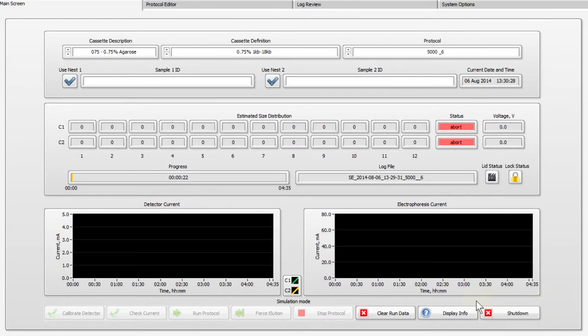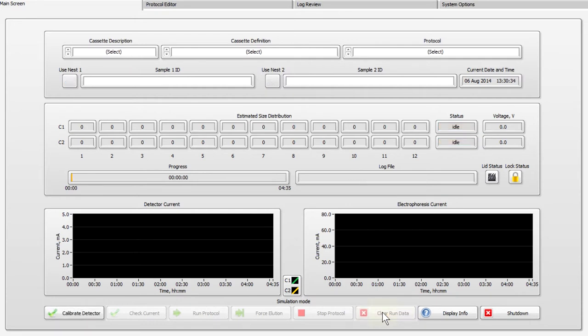Press the Clear Run Data button to clear fields from the previous run. Press the Calibrate Detector button.